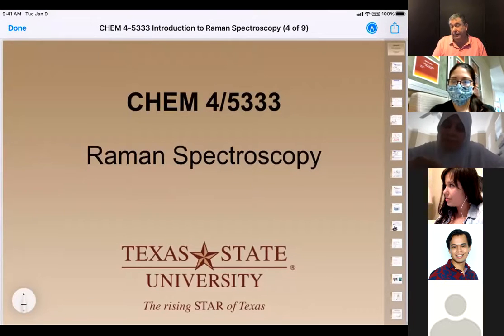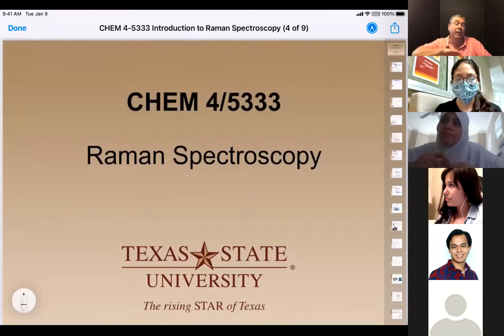I haven't worked in it in 14 years now, which is why I'm a little rusty on it, but no, I guess it's been 10. But I wanted to make sure that you saw that there's value in this particular form of spectroscopy as well. It complements IR, it uses the same wavelengths and bands, and it's useful in functional group identification. It's a good little tool to have in your toolbox. Okay, so that's all I have on Raman spectroscopy.